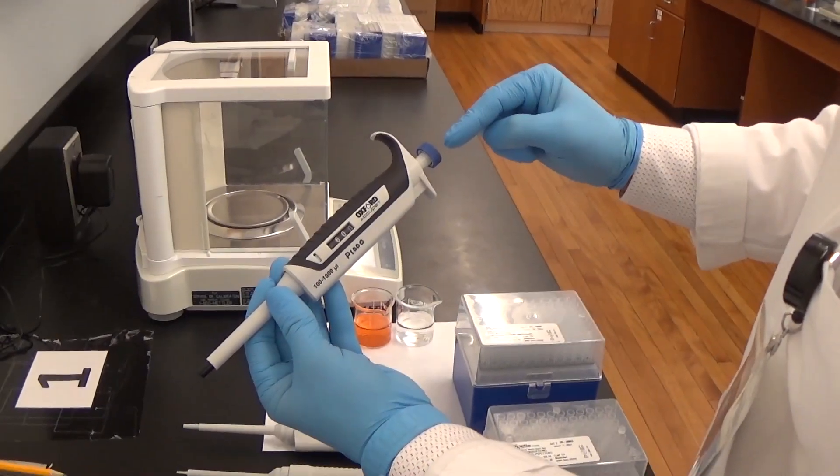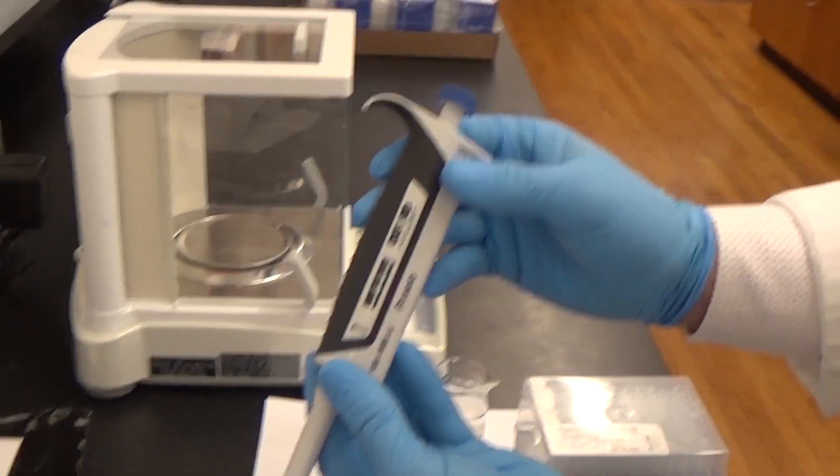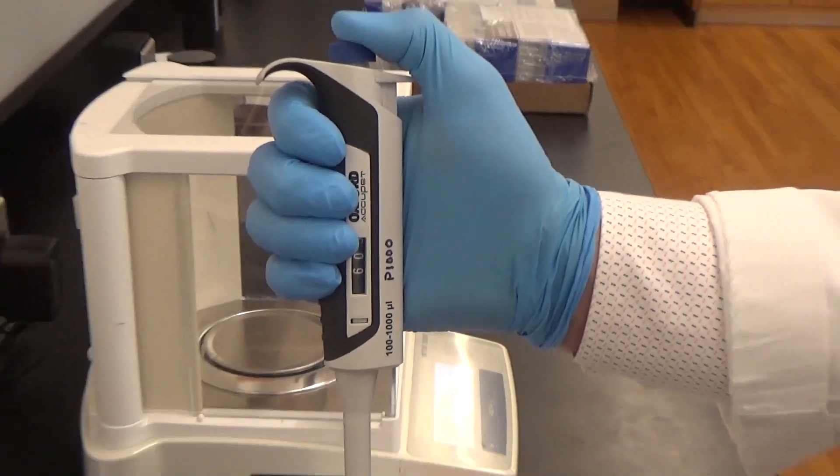The most important part is the plunger button. You need to set the desired volume by turning the plunger button and also you have to use this button to draw and dispense the liquid.